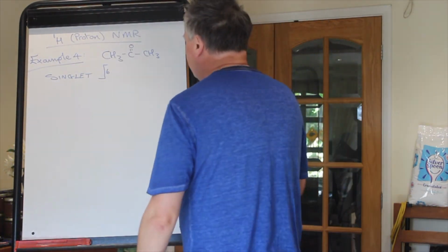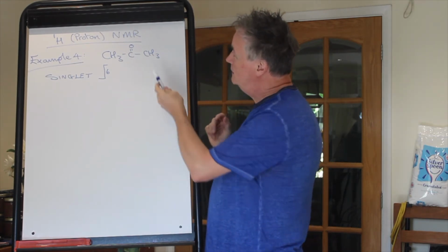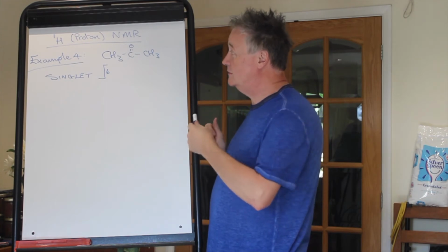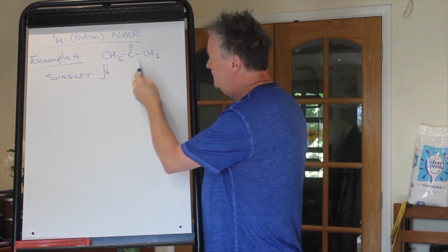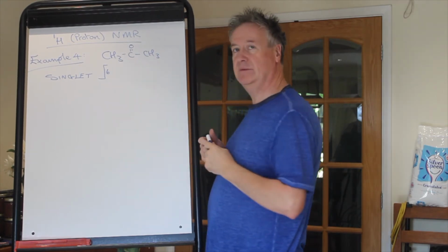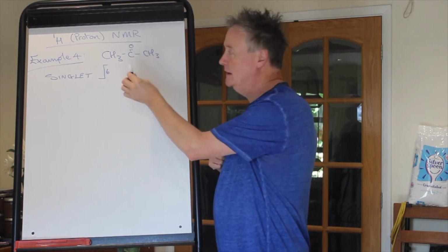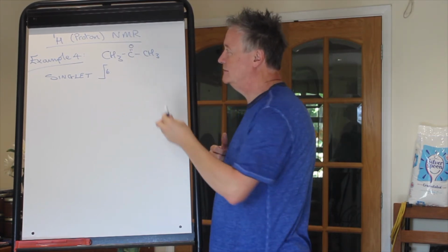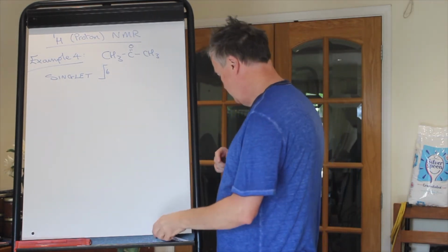Right, there we are. So, all the hydrogens are equivalent. So, firstly, they're all equivalent. That's why it's an integration value of 6. Secondly, that cannot couple that far away. You could only be coupled onto hydrogens here, but there aren't any. So that isn't split by anything. There's nothing to be split. Same from that, because they're identical. There's no coupling, no spin-spin coupling.